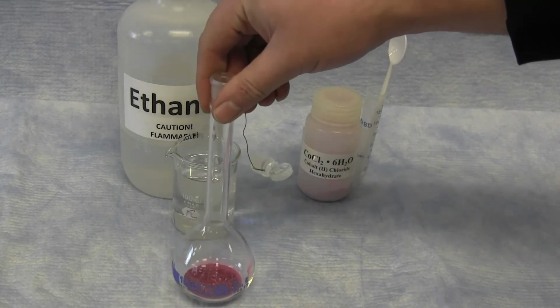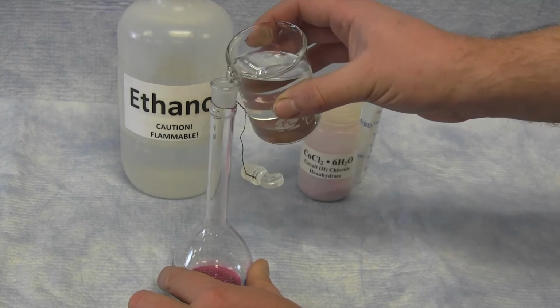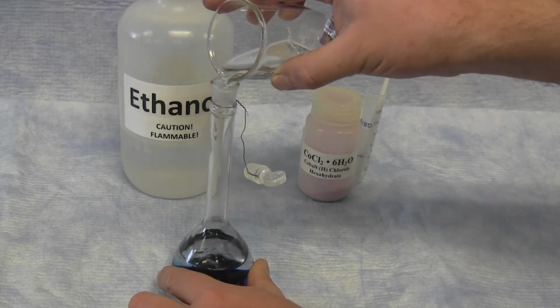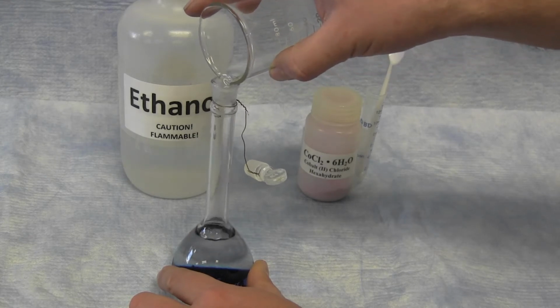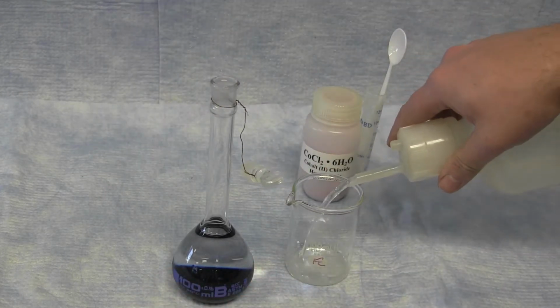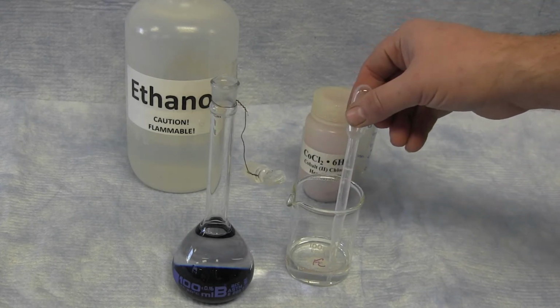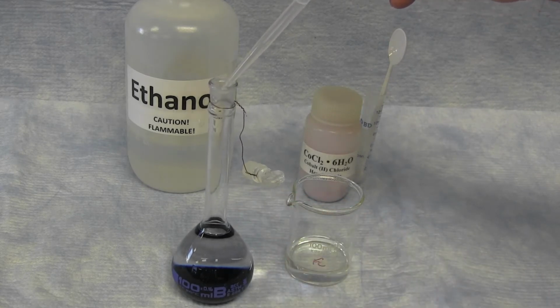When the cobalt chloride is added to the flask, you can then add ethanol to the flask. You will fill the flask up to the 100 milliliter mark with ethanol. As you're filling the bulk of the volumetric flask, you'll want to end at the appropriate mark, and you should use a pipette to add the ethanol slowly until the 100 milliliter mark is reached.